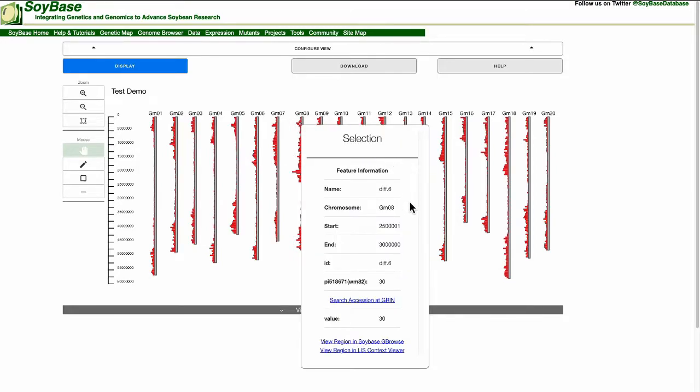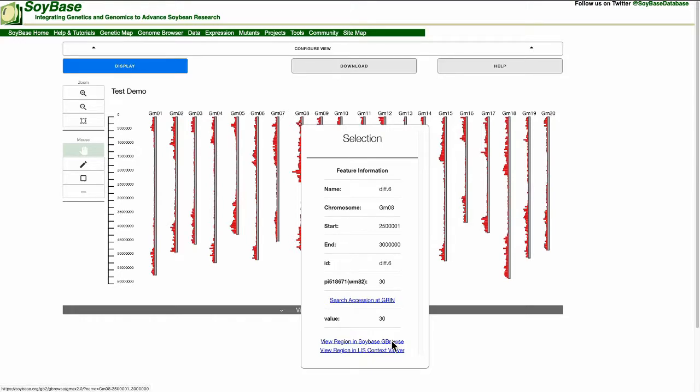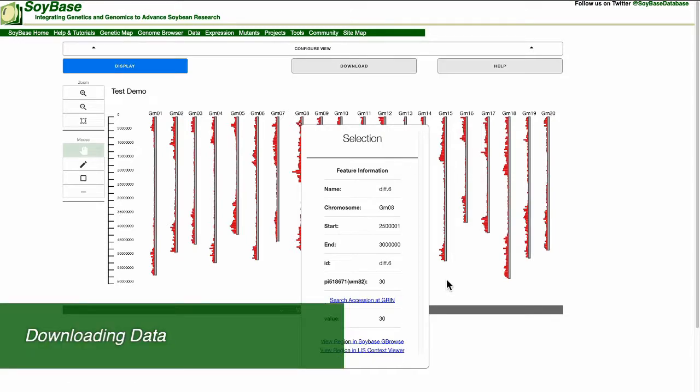For example, if we click on this bin, we can scroll down and click to view this specific genomic region on the SoyBase genome browser. We can also click to see this genomic region at the legume information systems context viewer.